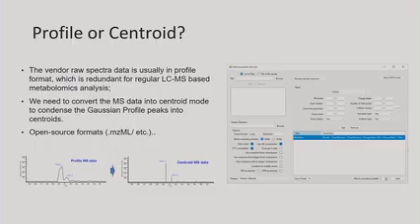The MS instrument will detect every single detail from the column, and generate a Gaussian peak inside a single scan. We have to find the most critical point for a specific m/z. This process is centroiding. We condense the Gaussian shape into just one point. After centroiding, the data complexity is reduced significantly, and the data processing is accelerated with almost nothing lost.